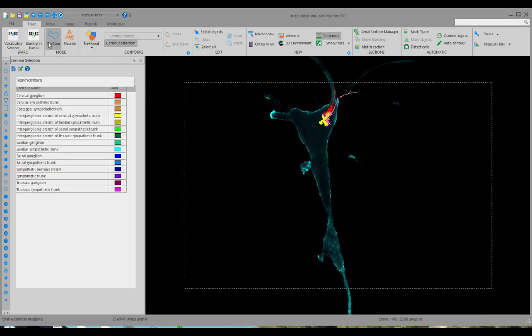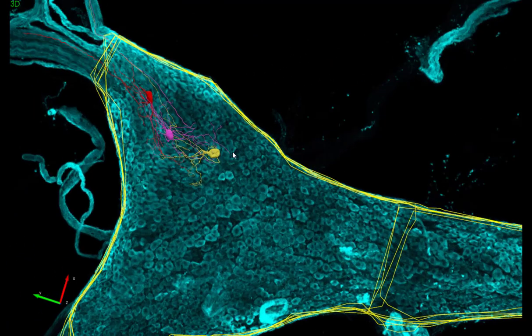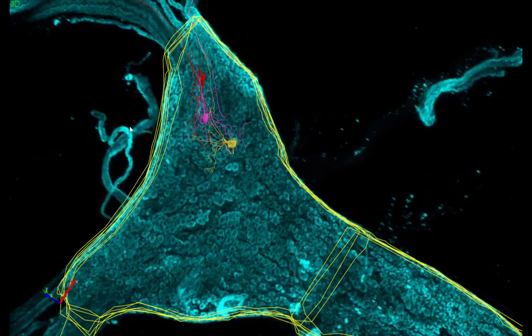Using the FAIR vocabularies in Neurolucida 360, the stellate structure from the low-resolution image was contoured on a series of 2D planes for a set interval. Its surface can be created on these contours in the 3D window to represent the volume of the whole ganglia in the data file.